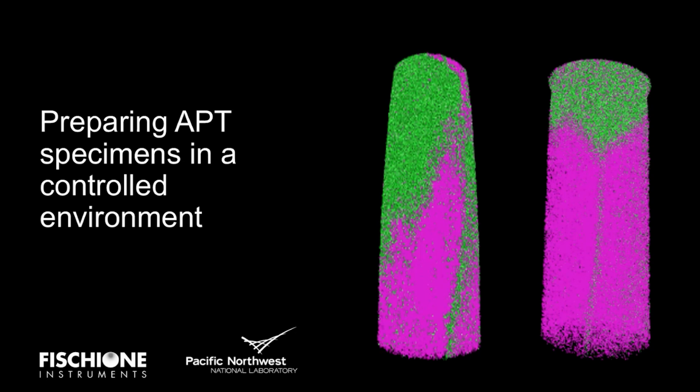Indeed, thank you. So another question I can see here is, can you use broad argon ion milling to perform post-FIB cleaning of APT samples? And if yes, is it better, the same, or worse? So I mean, you can do it. You can use broad argon ion milling for the post-FIB cleaning, but I will answer the results will be worse.